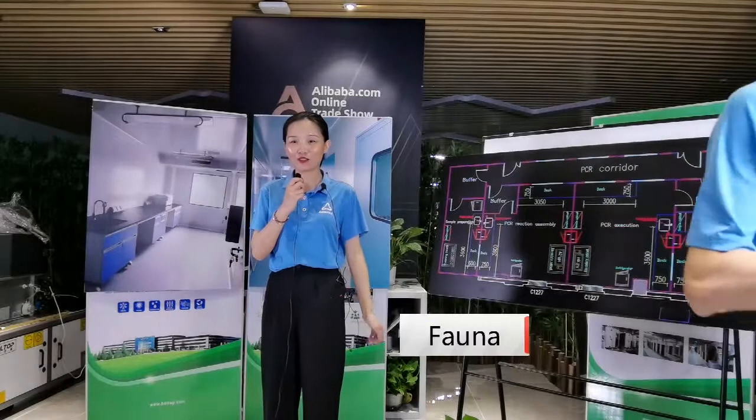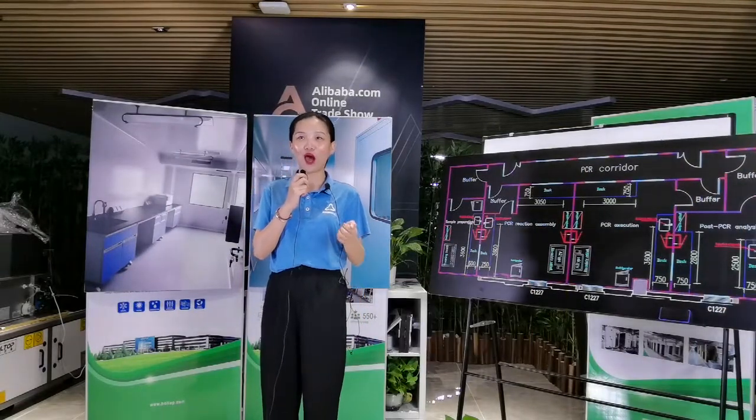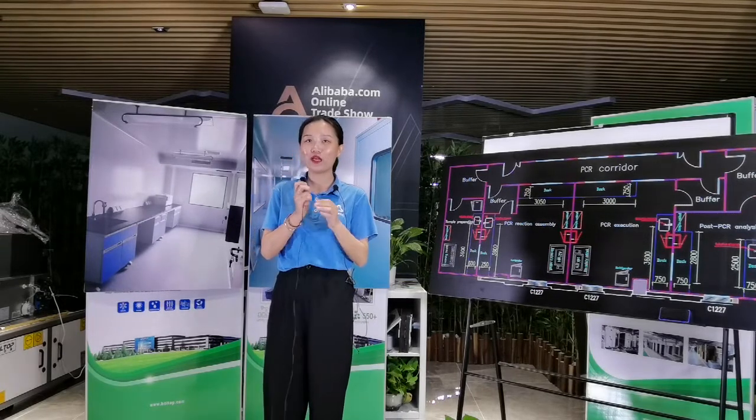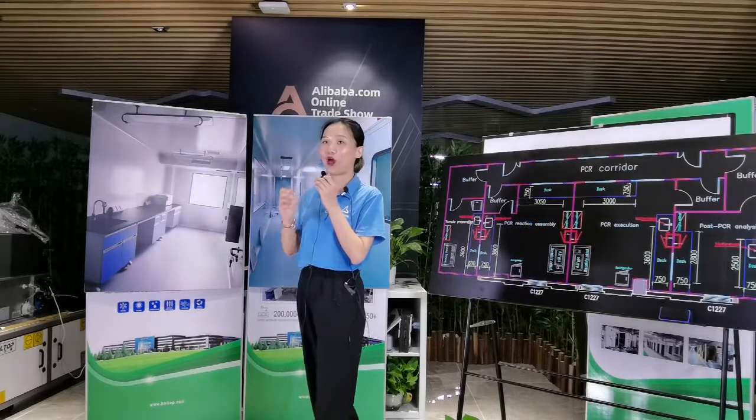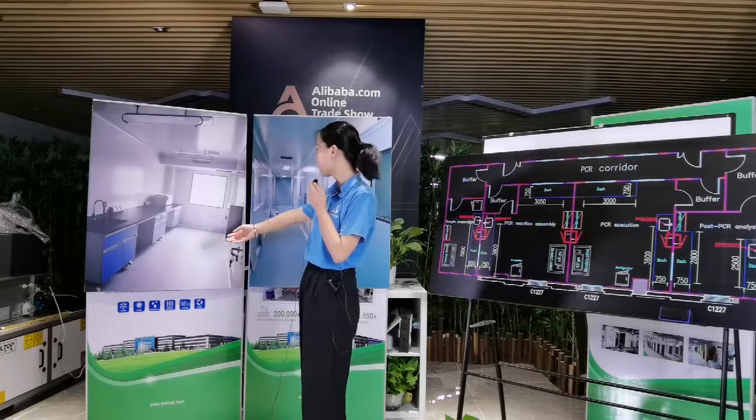Hello, everyone. I'm Fauna. Welcome to our live show. Now, I will show you how we can build a standard PCR lab. First of all, let's have a look at the picture behind me.